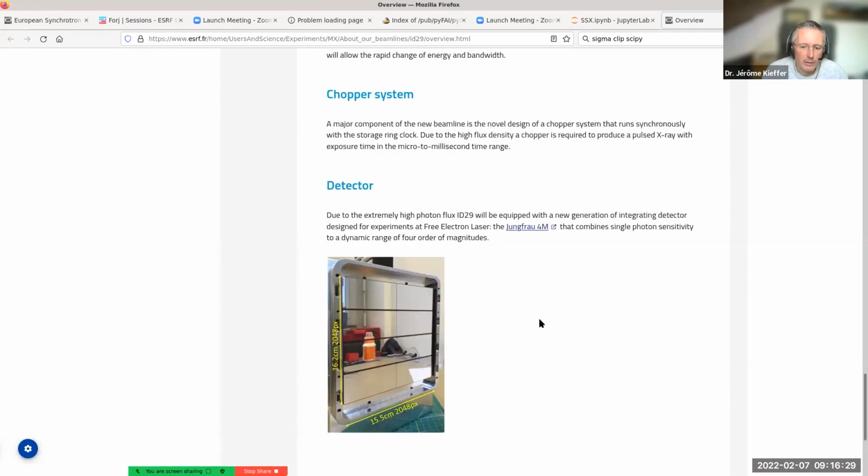We have 8 modules. Each of those 8 modules is connected with one 10 gigabit link that they will fill if operated at 1 kilohertz. Those 8 links will be multiplexed into a 100 gigabit link and connected to one port of a Power 9 computer.